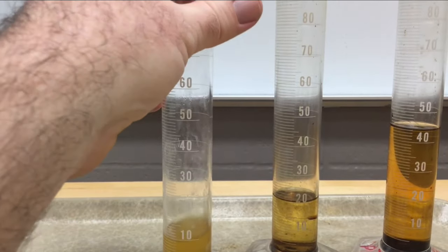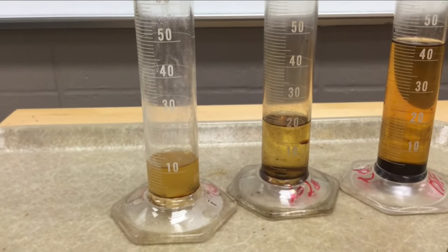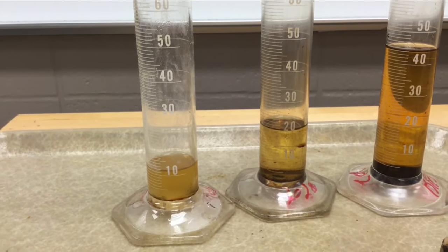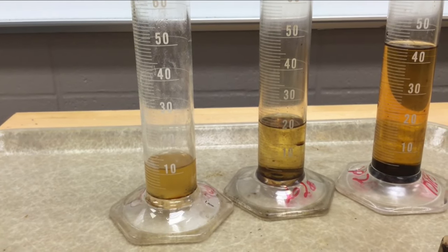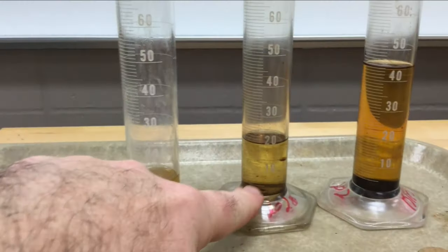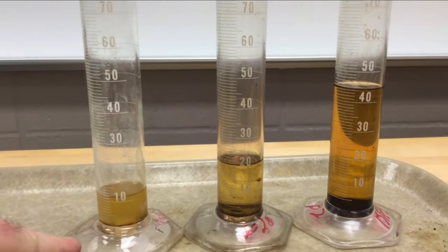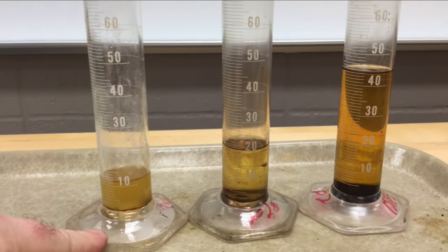Turn that around, there we go. And last semester I got 20. Well, that container is 6 months old. I opened it up probably a few times, so any of the light ends from room temperature are evaporating. Plus, we stopped collecting gasoline at 375 degrees. Maybe on this 2020 sample right here, we stopped at 400. So the refinery in 2020 wanted to make more gasoline, while now Scott Norman's refinery in 2021 wanted to make more diesel fuel.